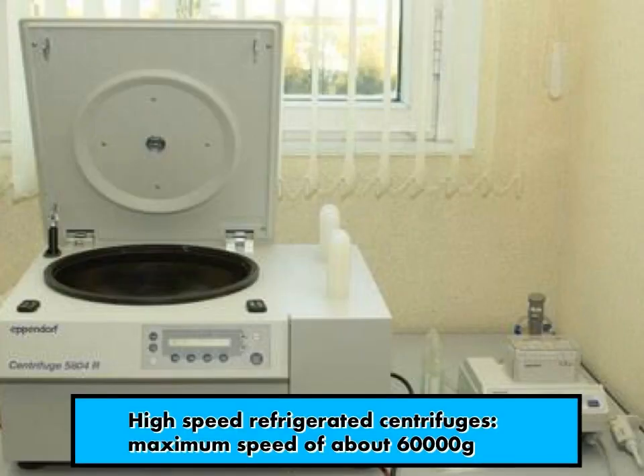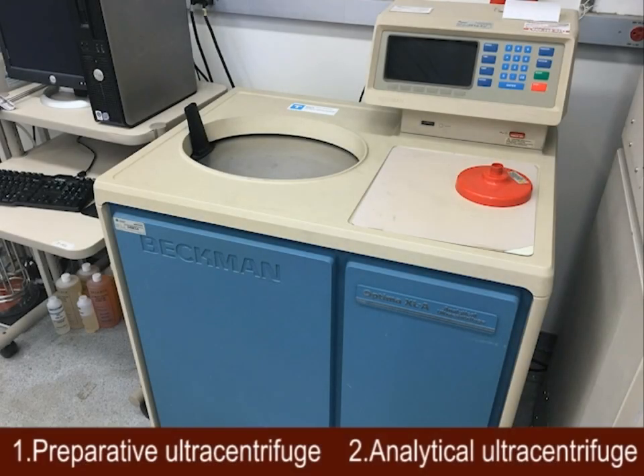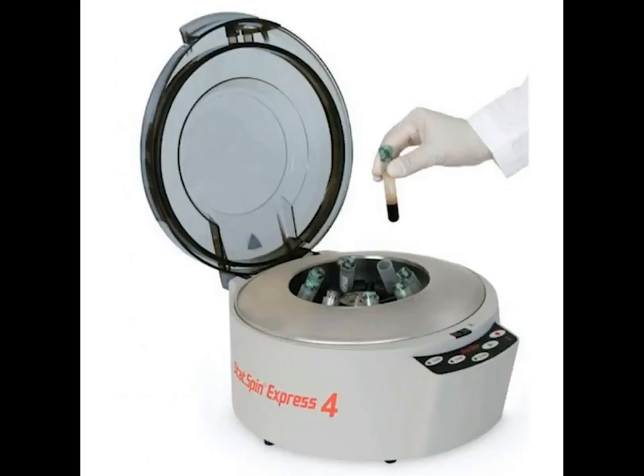High speed refrigerator centrifuges can generate a speed of about 60,000 RCF and are used to collect microorganisms, cellular debris, and large cellular organelles. Ultracentrifuges can produce a relative centrifugal force of about 600,000 RCF; their chamber is refrigerated, sealed, and evacuated. They are employed for separation of macromolecules, separation of various lipoprotein fractions from plasma, and deproteinization of physiological fluids for amino acid analysis.